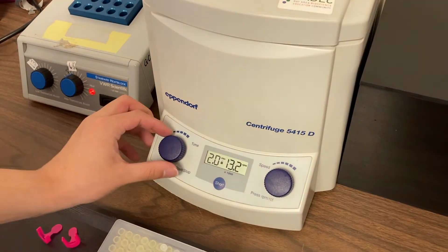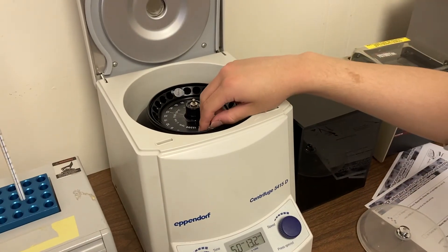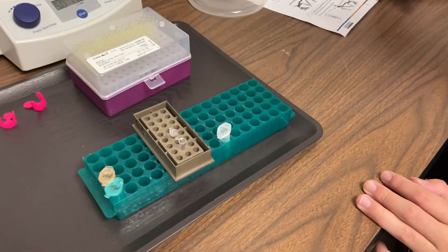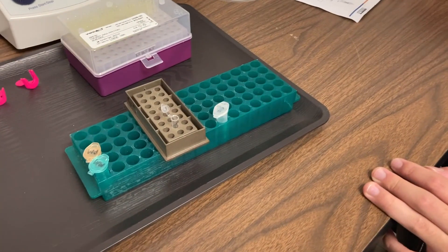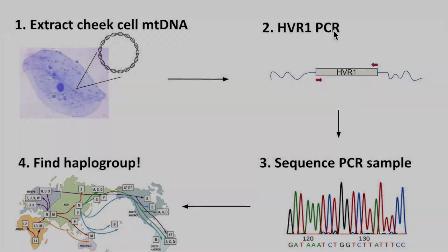We're still going to spin it at over 13,000 RPMs, but this time we'll run it for 5 minutes. This spin is really the last step in DNA extraction. Our DNA is now ready to move on to PCR. We've successfully extracted mitochondrial DNA from our cheek cells. Next, we'll move on to polymerase chain reaction, or PCR.